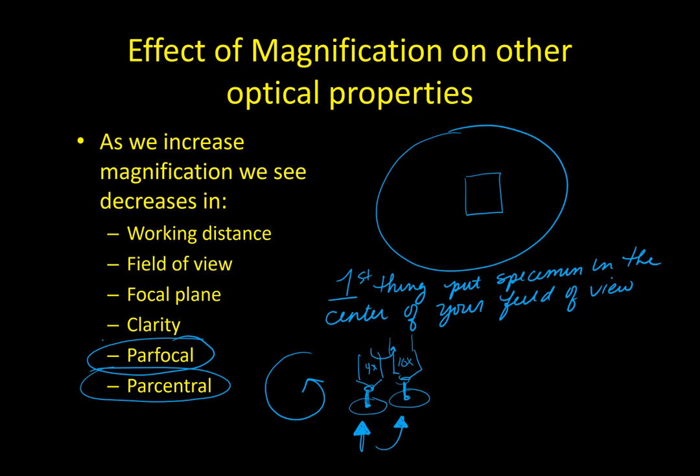No, we don't. So while the idea is there, it's not necessarily that perfect. Now, is it close? It actually is fairly close. Normally, when you switch over, you can still see your object, but it may not be perfectly centered, so you kind of have to adjust just a little bit.